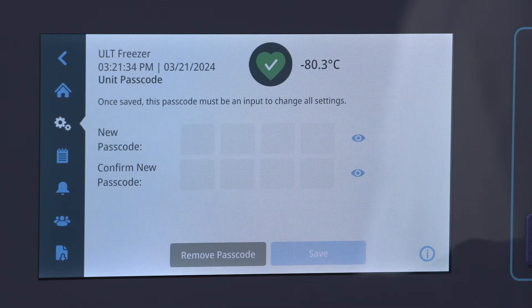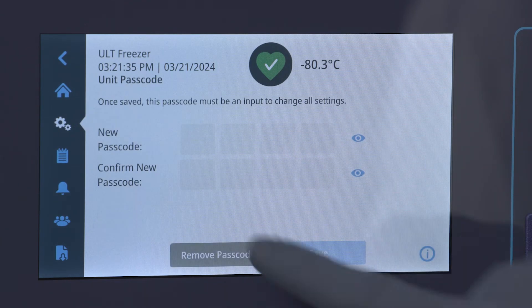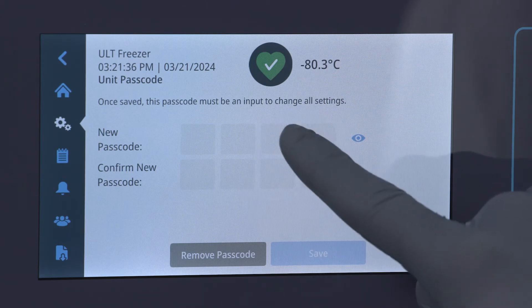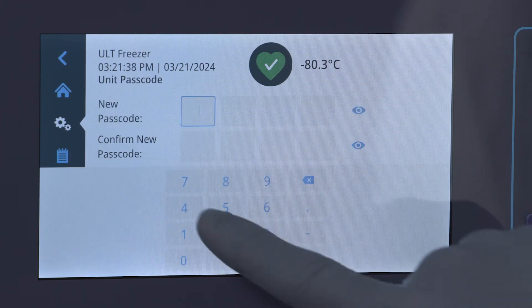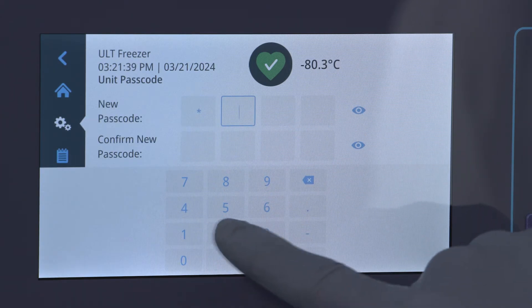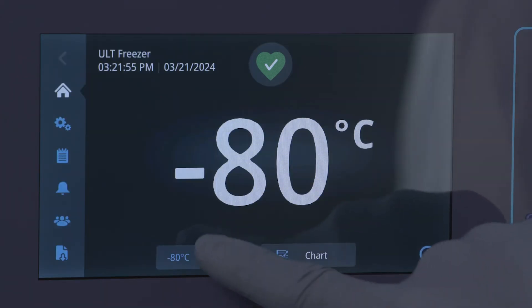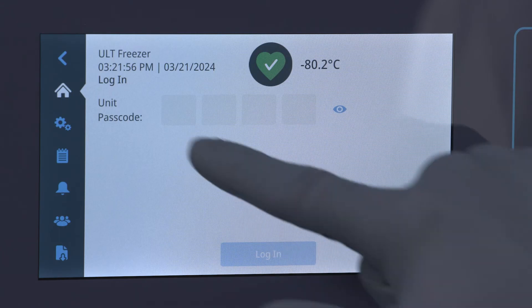New to the user interface is a programmable four-digit access code, which can be applied in full access mode but is required to change any settings.